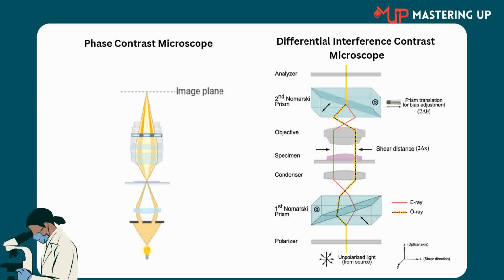This microscope uses a beam shearing interference system to produce monochromatic shadow cast images that show the gradient of optical paths for low and high spatial frequencies. DIC microscopes produce high resolution images with faux 3D effects.